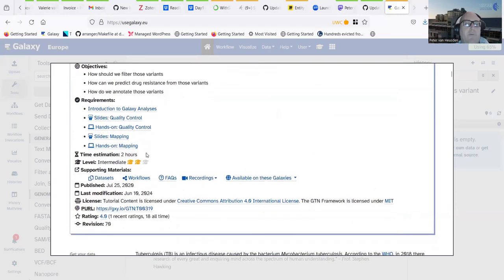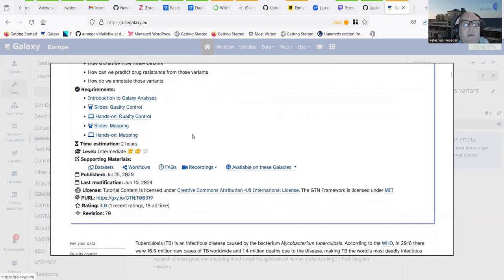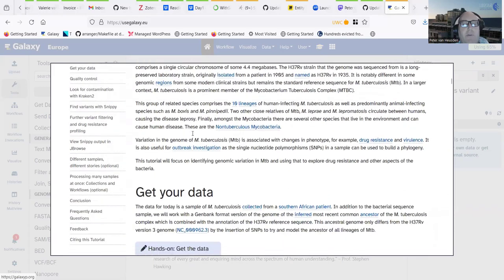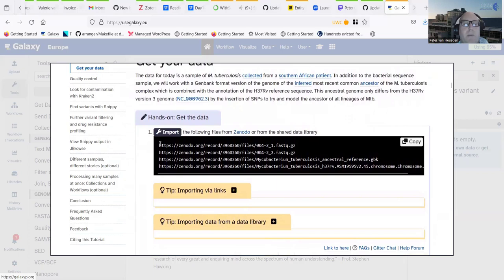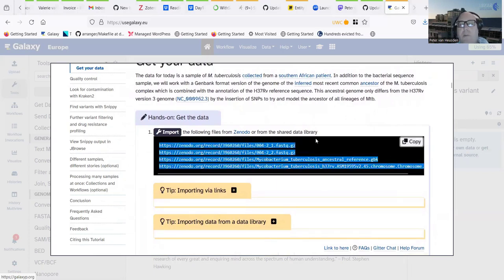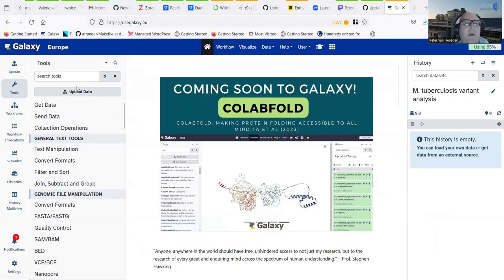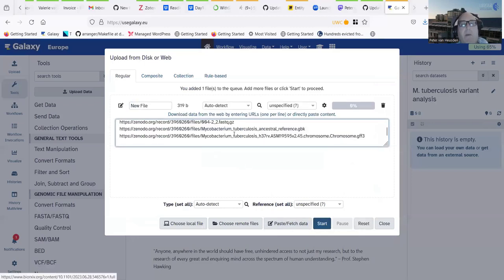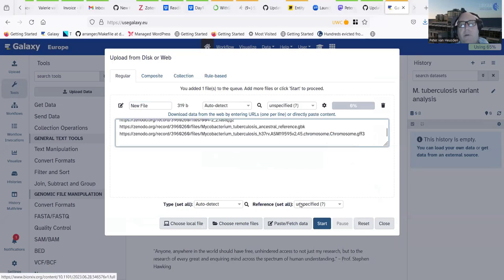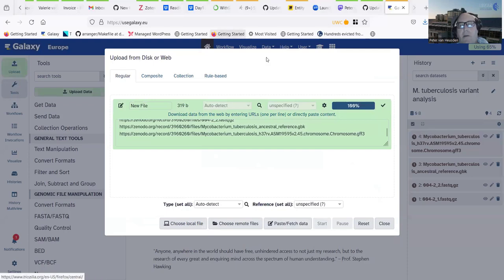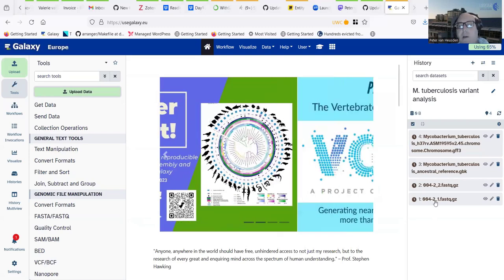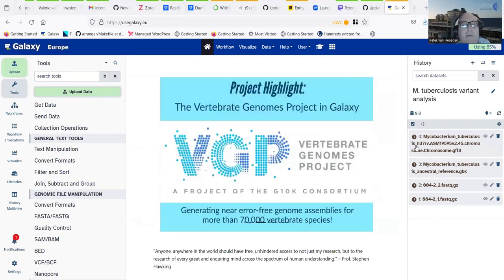I'll leave you to read through the introductory text at your own time. Scrolling down to the first hands-on part where it says 'get your data,' we can copy these links from here. I'm going to click away from the tutorial window, go to the upload data view, click 'Paste/Fetch data,' paste these links into this window, and click start. Immediately some activity happened in Galaxy — this is all gray, meaning jobs are waiting to run, downloading the files from the pasted links.